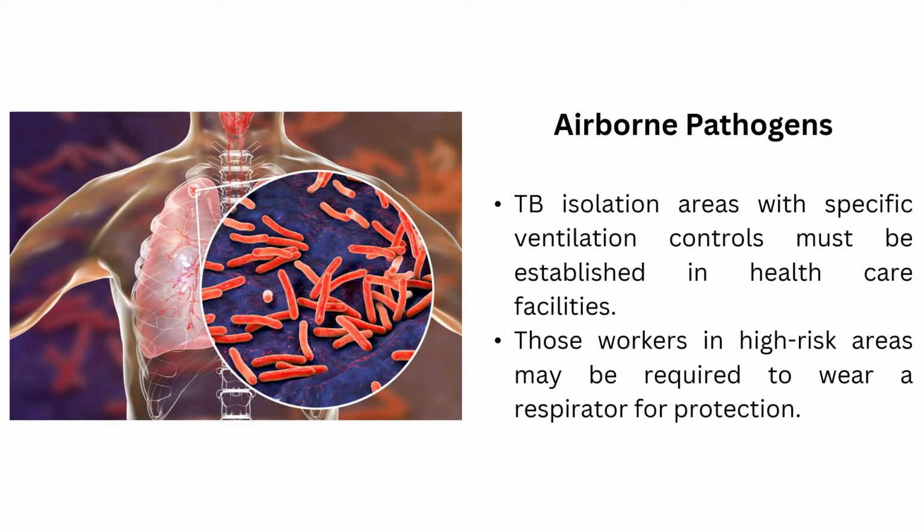Because of a global resurgence of TB, OSHA issued a statement in 1993 that the agency would enforce CDC guidelines for preventing the transmission of tuberculosis in healthcare facilities. Also, there's an epidemic of COVID-19. So, of course, there are stricter policies regarding the use of PPE as well as the proper dealing with those types of specimens. The purpose of the guidelines is to encourage early detection, isolation, and treatment of active cases.